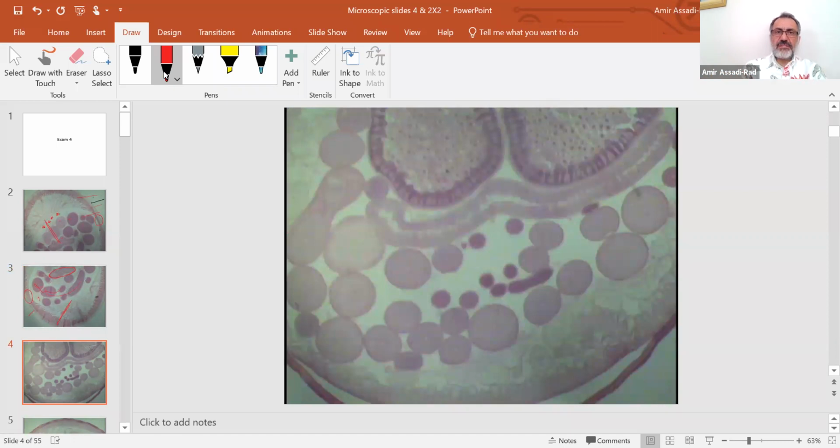Female uterus, in here you should know the differences. Okay, uterus, oviduct, and all of these, even though they look like a wheel, all of the small ones are the ovary. Intestine, longitudinal muscles, and of course your epidermis. And of course, this area right here, where I put the dot, those are pseudocoelom area.